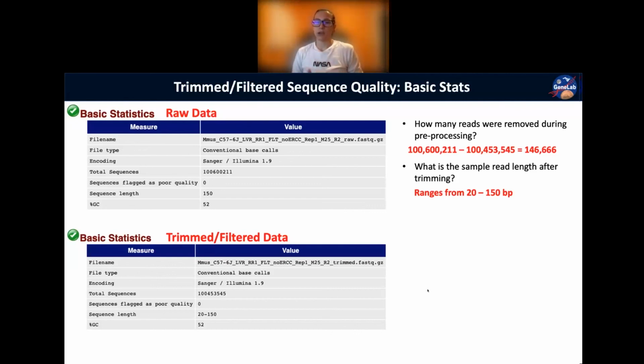You guys unmute your mics, put it in the chat. Isn't it to cut out the polymerization in the beginning of it? What do you mean by that? Because it showed on the graph before that at the beginning there was an uptick at the beginning of the read.